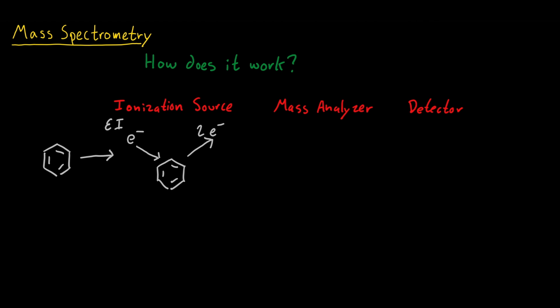That leaves our benzene having a net positive charge. So for benzene, that would be a positive charge, and then a radical on one of the carbons.